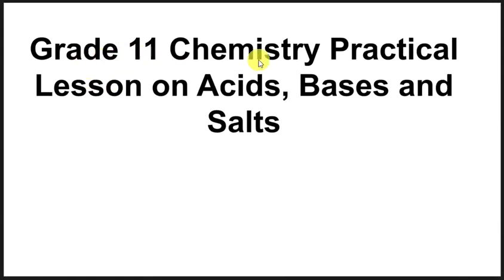In today's lesson, I'll be looking at the grade 11 chemistry practical lesson on acids, bases, and the salts.